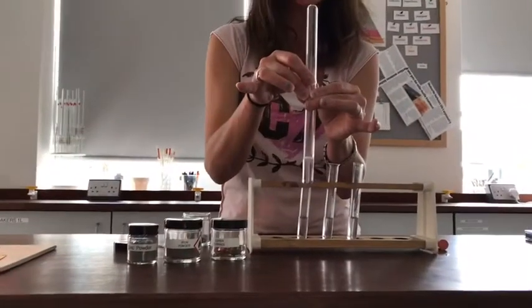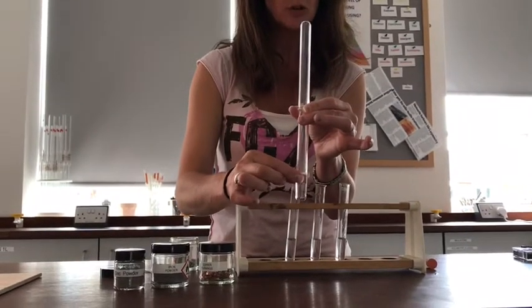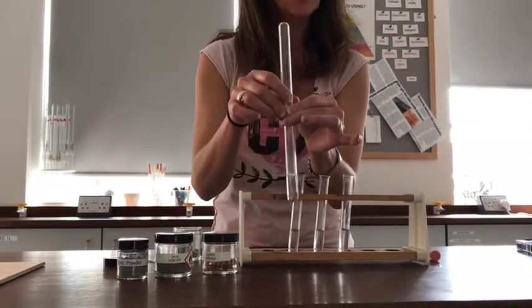This is pretty much finished. You can see there's still a tiny amount of fizzing going on there, and this tube has actually got quite hot around where the magnesium was reacting, so you might like to think of the word we use for reactions that produce heat.